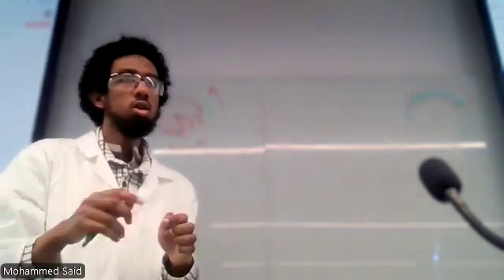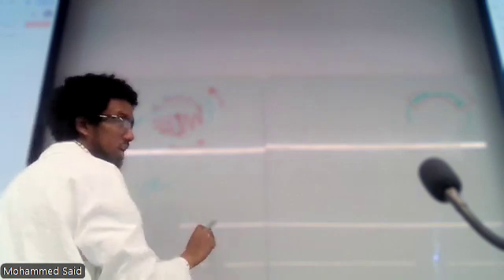Bear in mind they're labeled, right? So make sure you're using the right one. And now you're able to put a mark in between, so that way you could separate. This is HT99, this is J53R, that you've labeled and sliced your plate accordingly with a marker. And then essentially, you do this process for the first two plates.